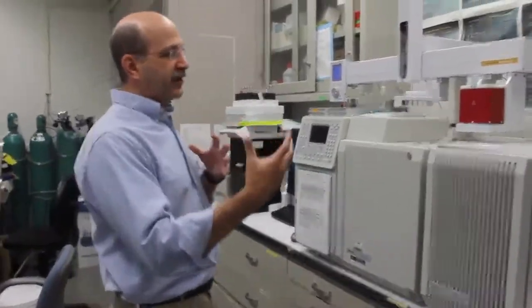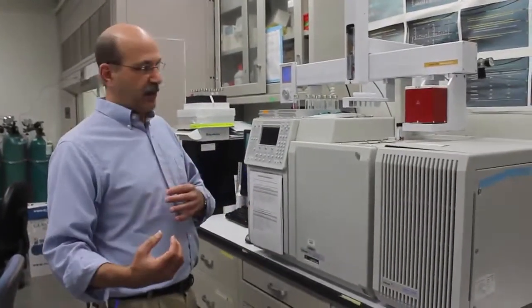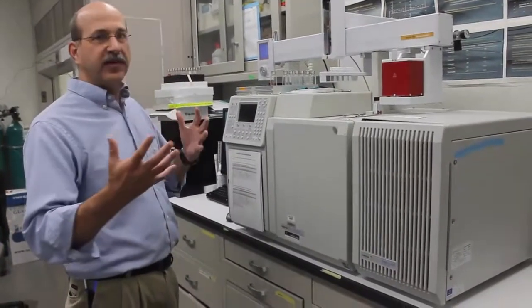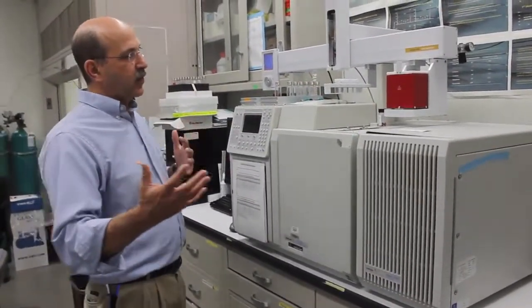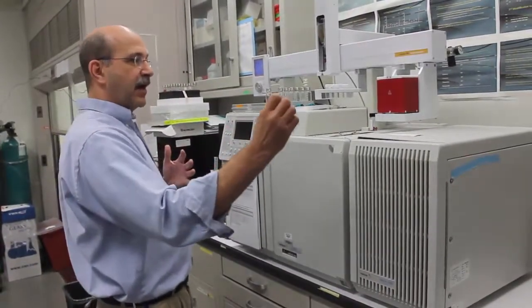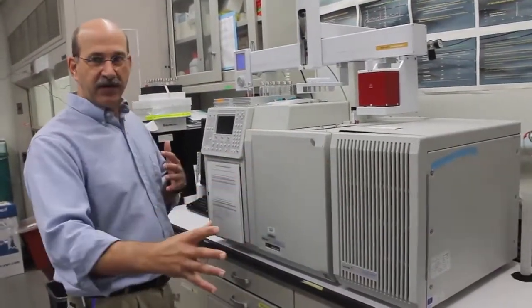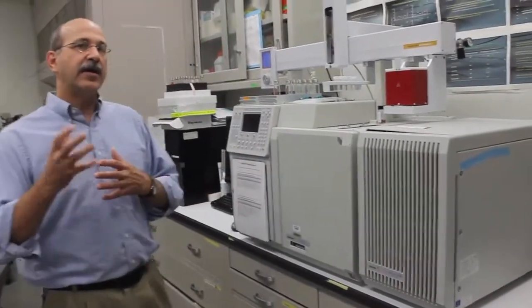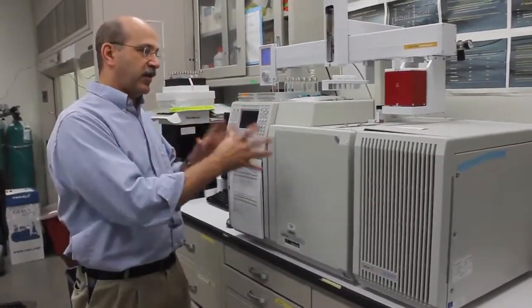So with the selection that we have, we'll start with a sample. The sample may have multiple contaminants in it or multiple things that we just want to analyze. We'll inject the sample, it'll go through the column, and it'll come out, and the mass spectrometer will tell us how much and what the samples are. And we can select a lot of different ways to introduce it to the instrument.